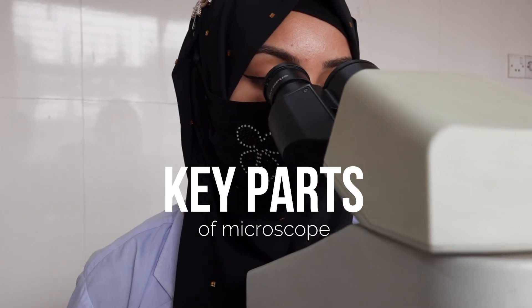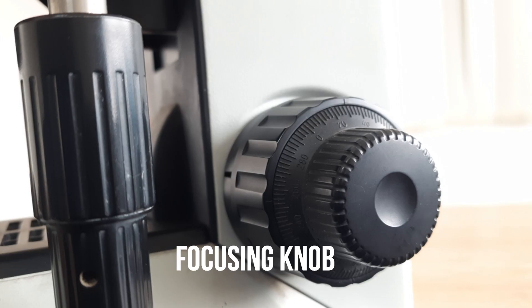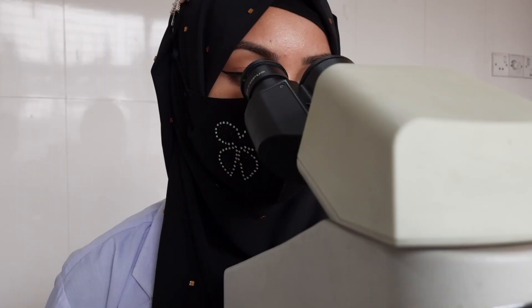A typical compound microscope is composed of several key parts including the base, arm, stage, objectives, eyepiece, focusing knobs, light source, and condenser. Each of these parts plays a vital role in helping us observe tiny specimens.